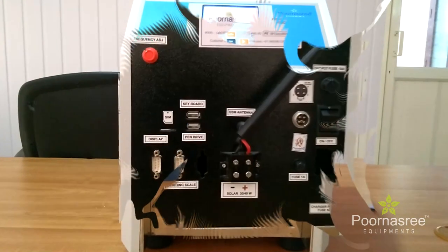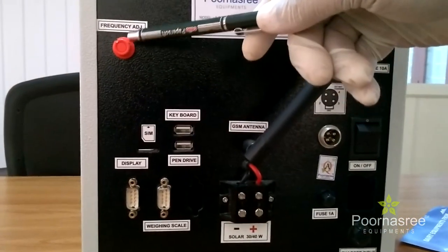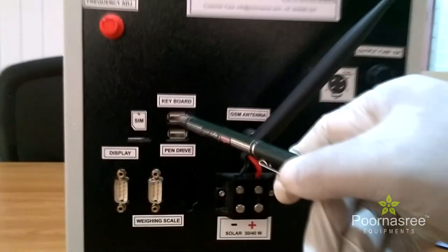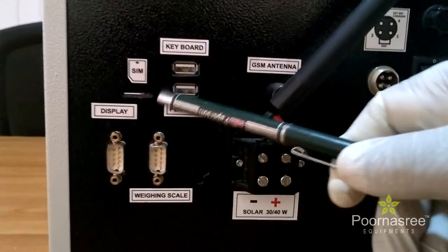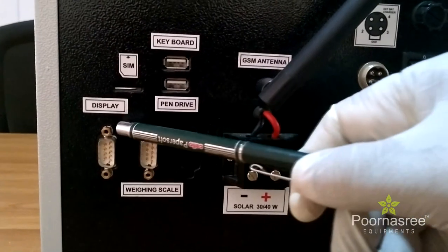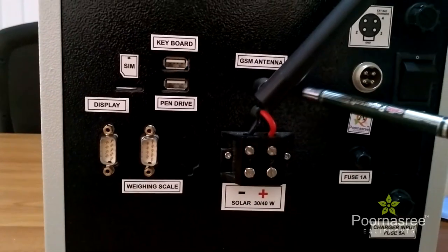Now let us see the back panel of Lactosure DS. This red symbol means it is the vibrator, so that the frequency we can adjust. This is the key part we can connect here. Here we can connect a pen drive. And here we can put a SIM for the messages. And this is the display connection. And this is the weighing scale connection. And this is the GSM antenna.